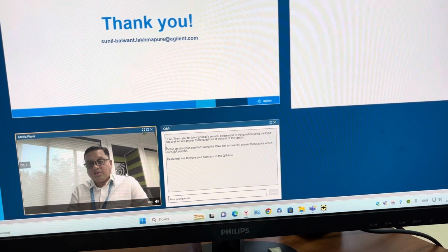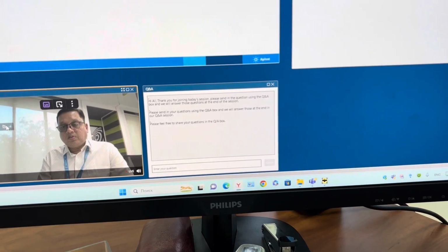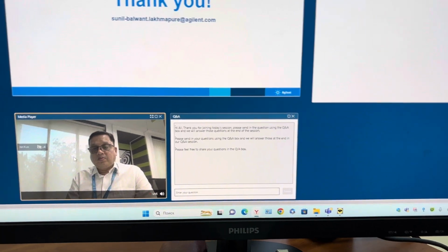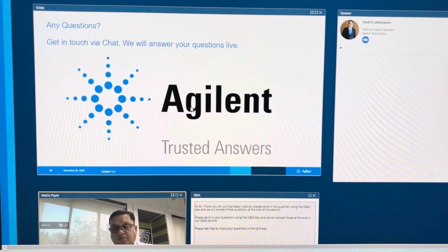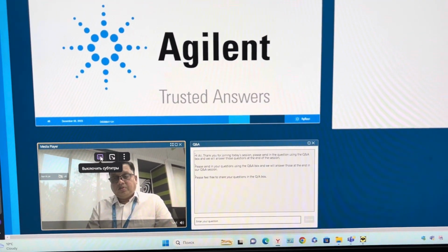Thank you, Sunil. And around this question only about the falling down of the septa, there is one question from a customer who says that they have seen this incident of septa falling down while injection was carried out in the HPLC. So, if you can just briefly give the reasons why it can happen.